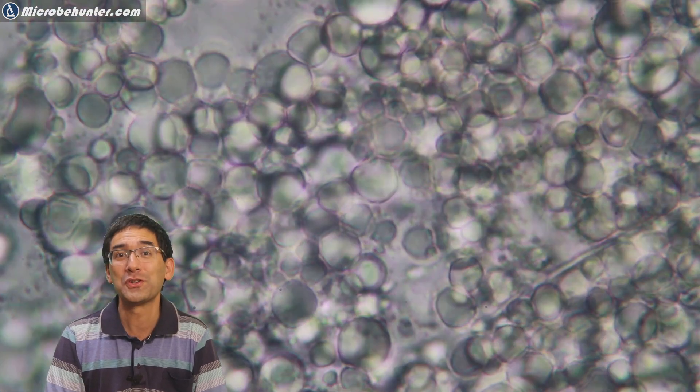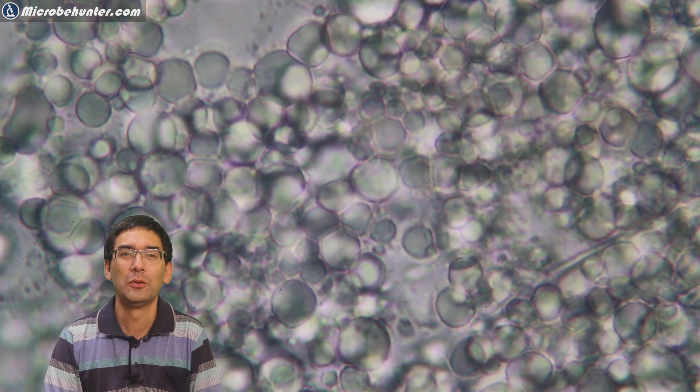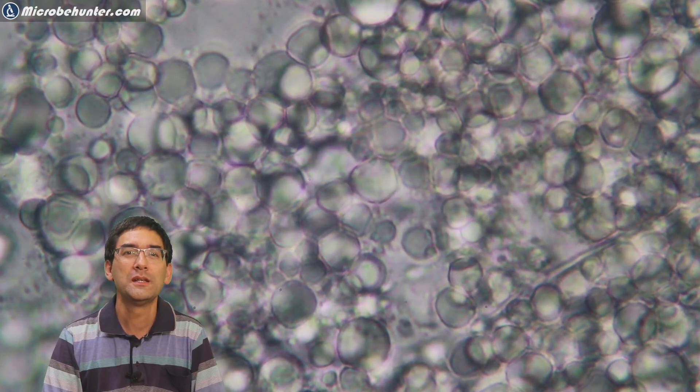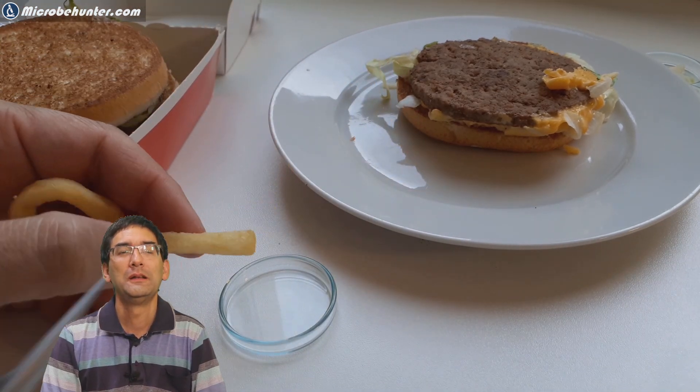Quite nice to see that those little drops are so small that they're not able to easily recombine into larger droplets. That's basically the hamburger sauce under the microscope. Even though the hamburger sauce did have a slightly yellowish color - maybe they added a little bit of egg yolk, wouldn't surprise me - still, because the layer was so thin, individual colors are not visible.